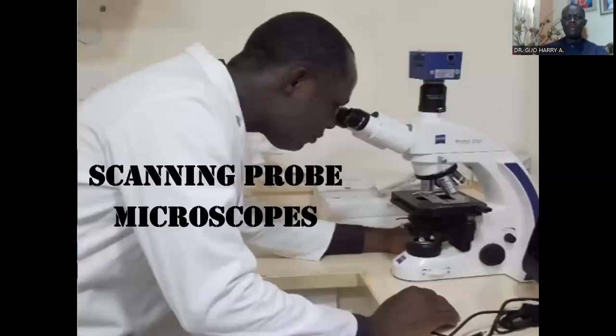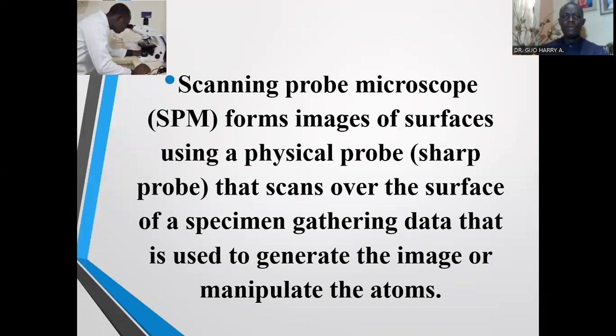The scanning probe microscope is the next type of microscope we want to talk about. The scanning probe microscope forms images of surfaces using a physical, sharp probe that scans over the surface of a sample, gathering data that is used to generate the image or manipulate the atoms.